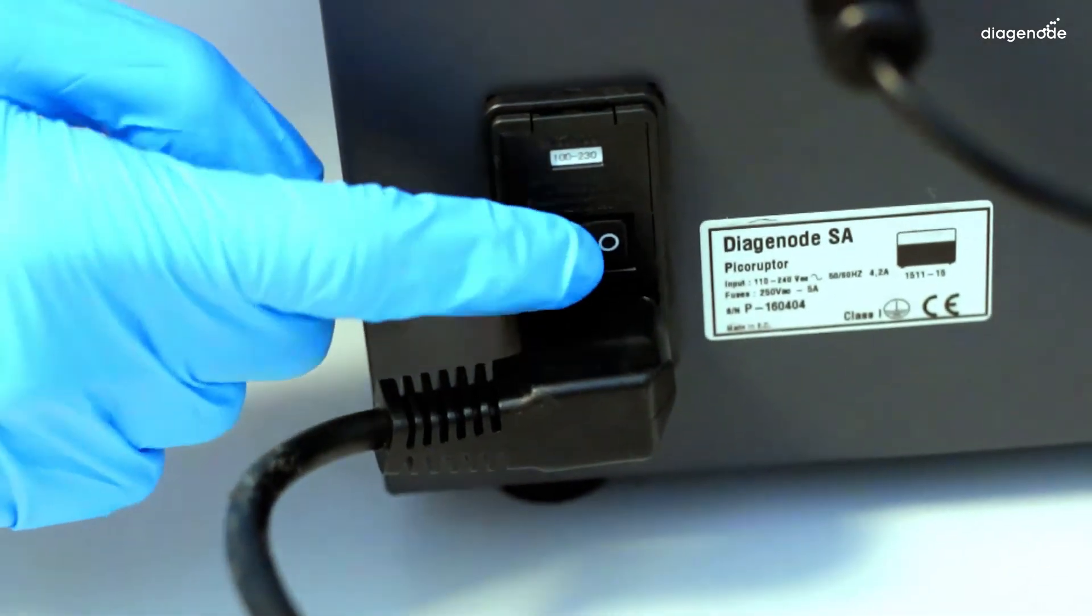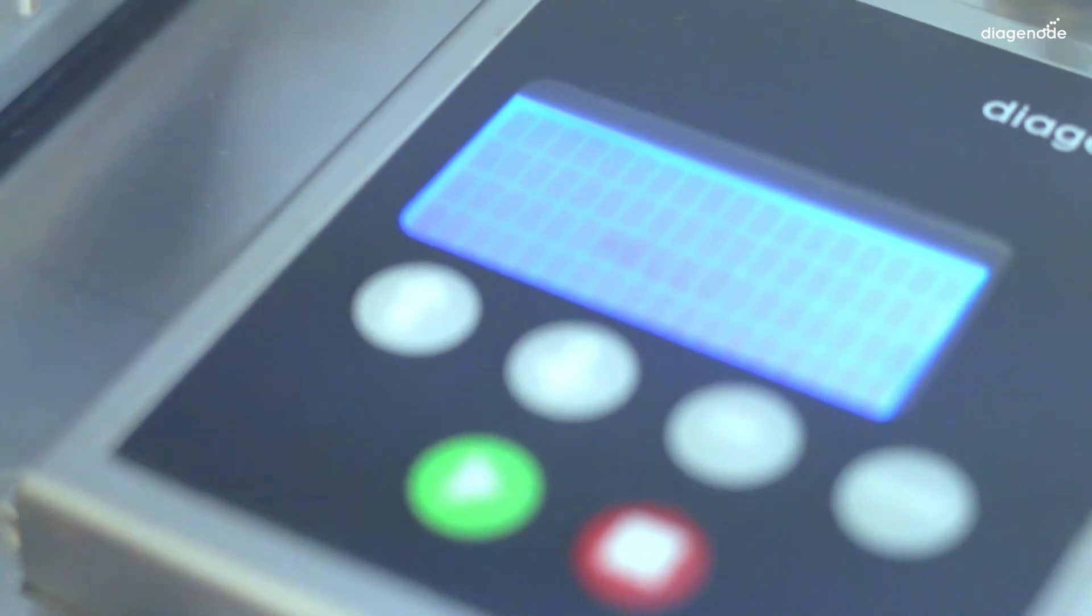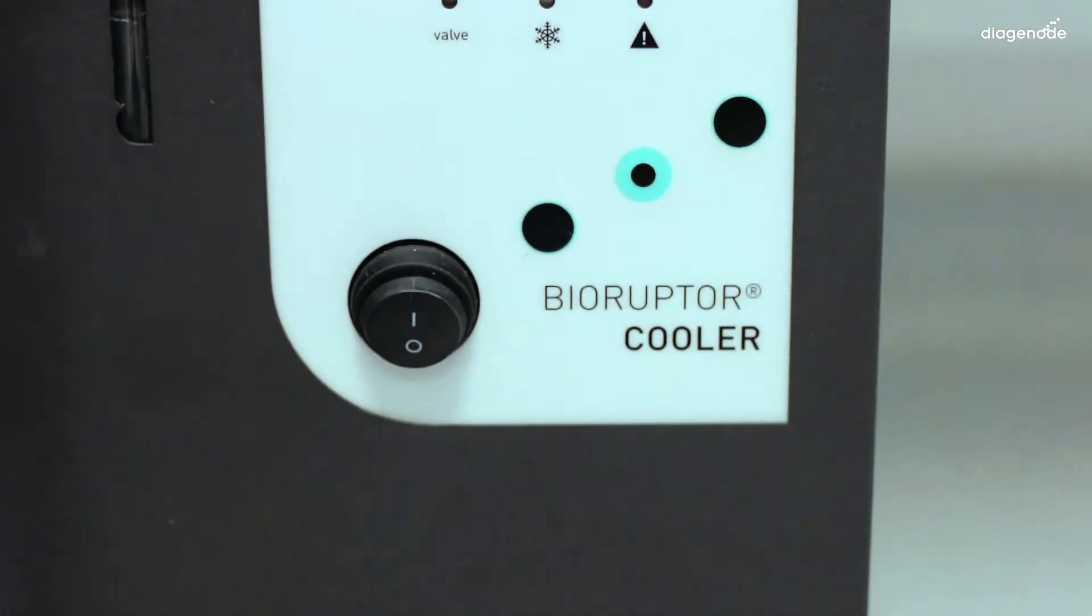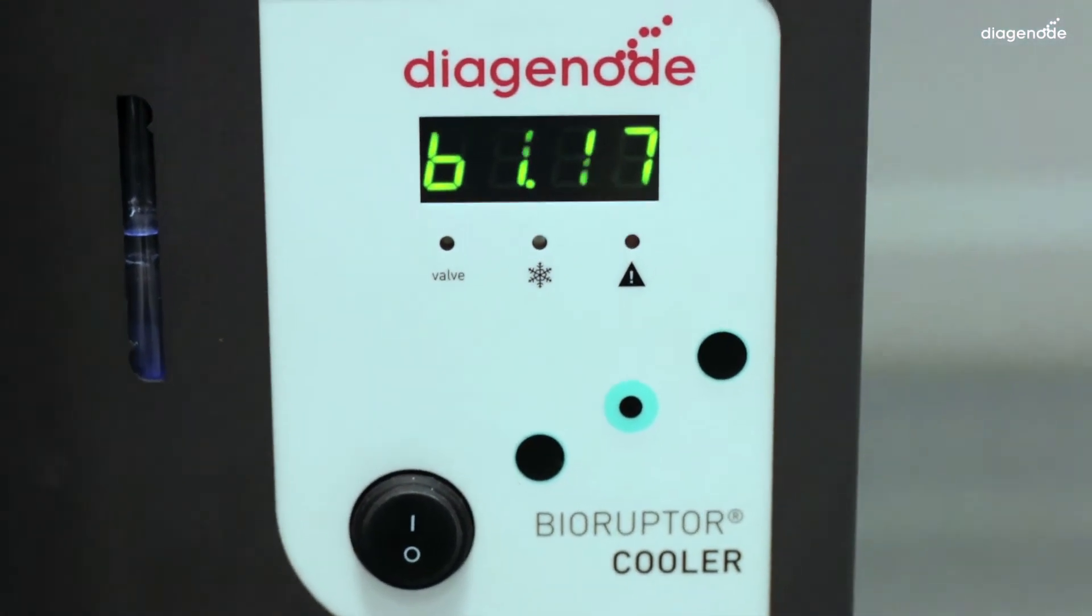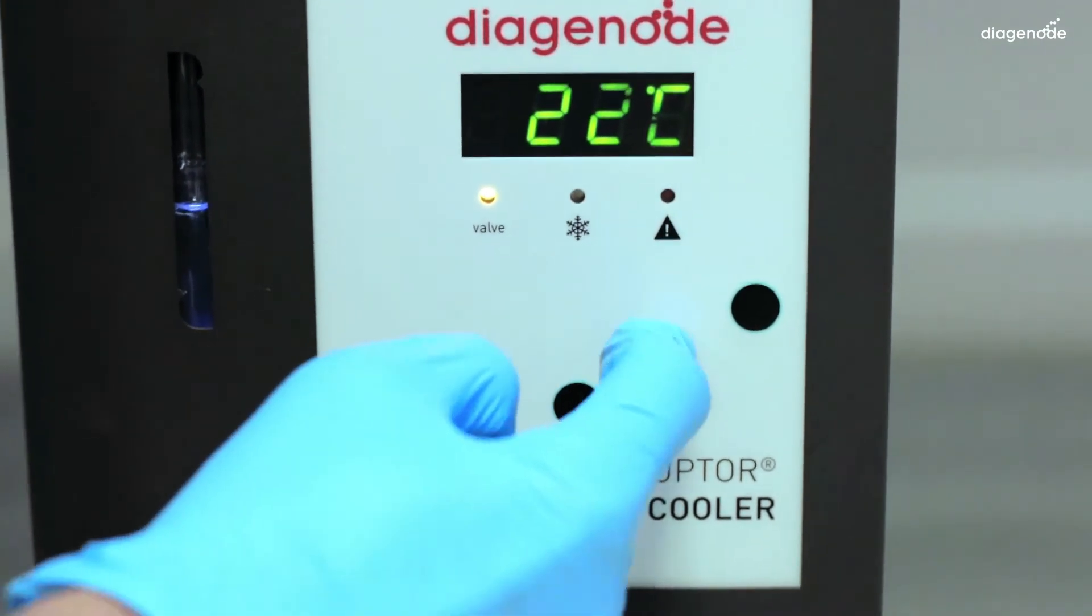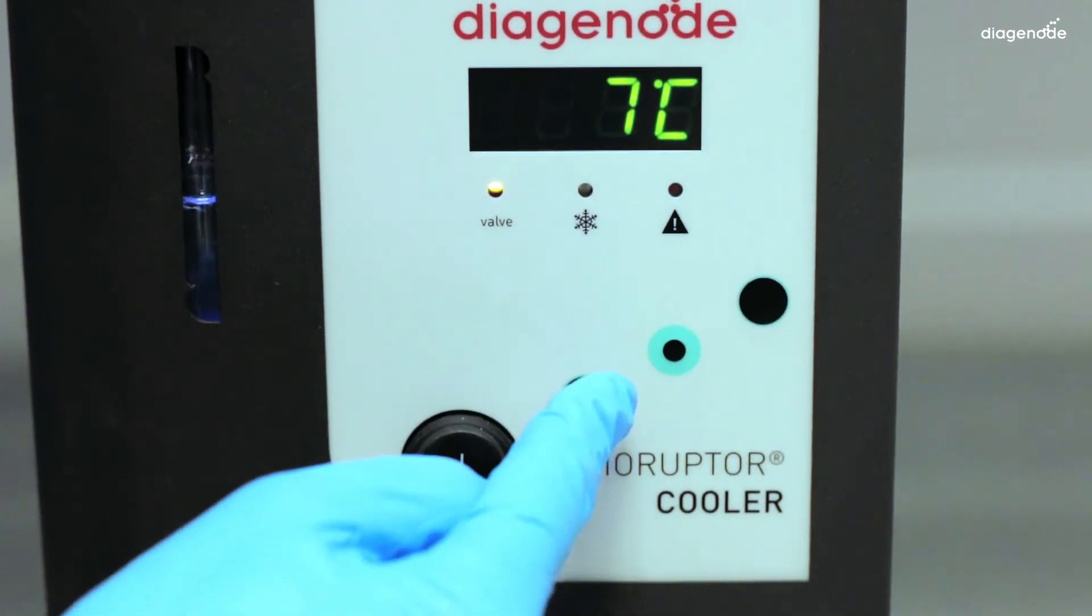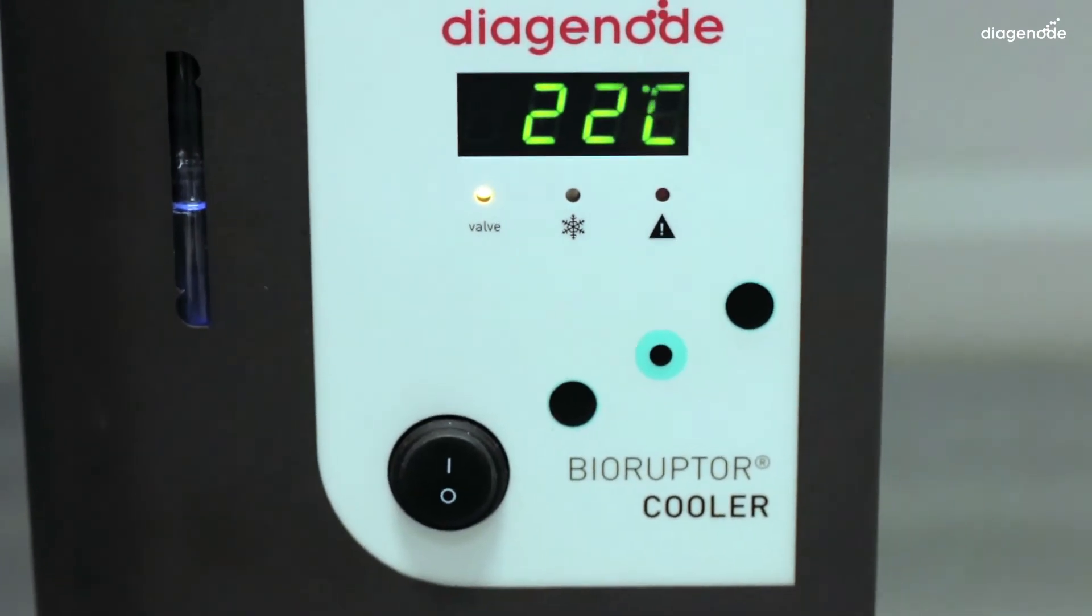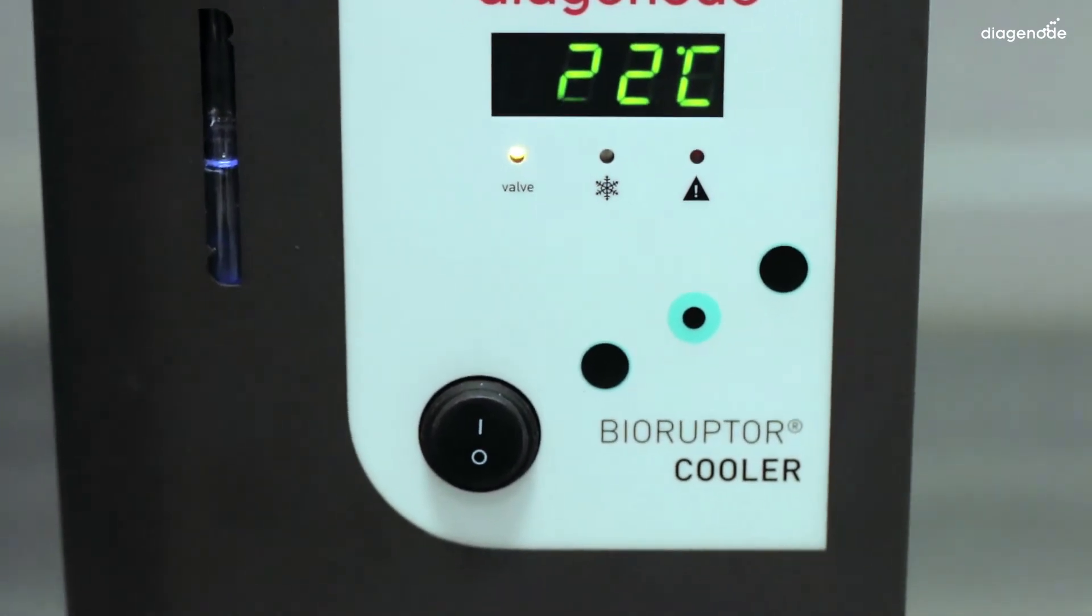Switch on the back side of the sonication unit and press the main switch on the front side of the cooler system to start the pump. Set the temperature to 4 degrees by pushing the center button. The button up will raise the desired temperature, while the button down will lower it. When temperature is set, push the center button one last time.